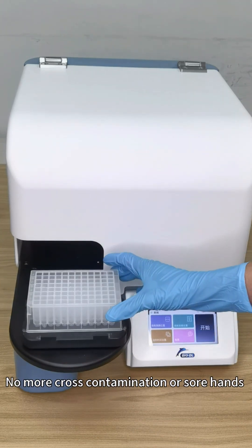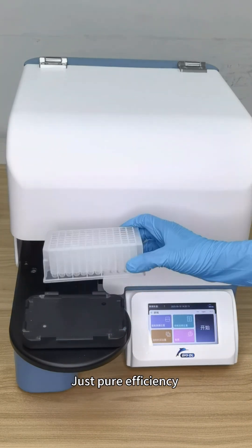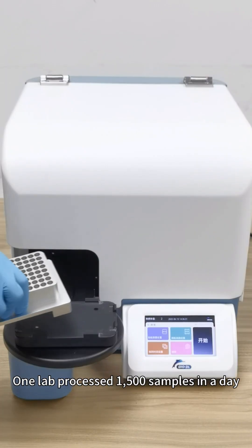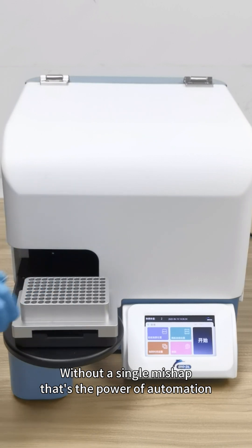No more cross-contamination or sore hands, just pure efficiency. One lab processed 1,500 samples in a day without a single mishap. That's the power of automation.